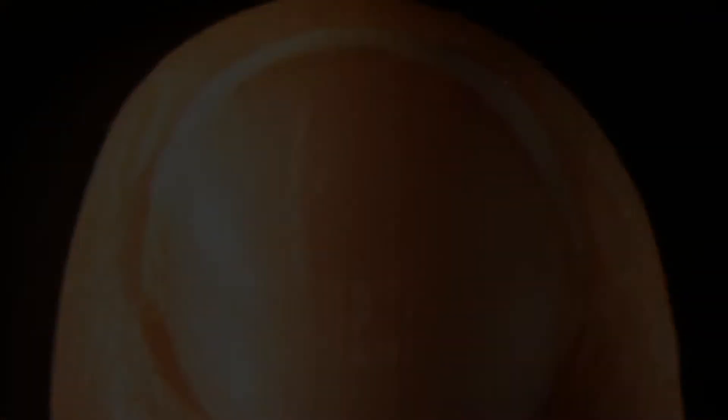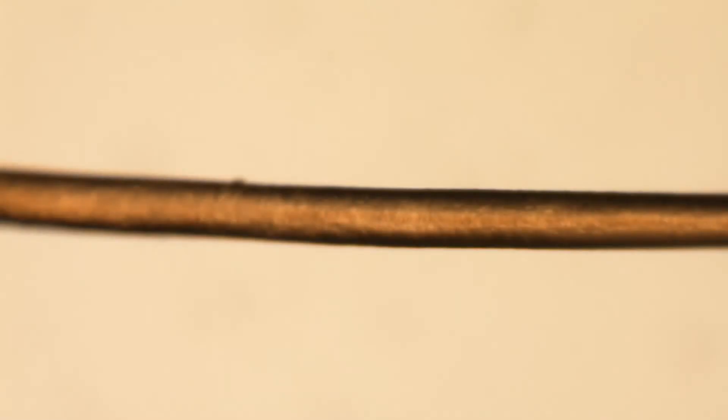And finally, what do you think this is? It's my hair. I don't just spend all day looking at hair and skin under the microscope. Instead, I work with baby fish.